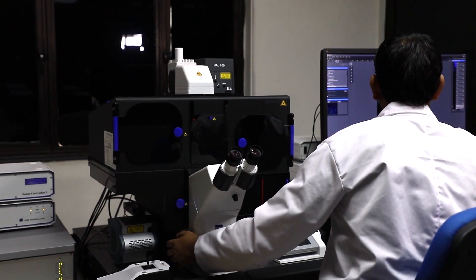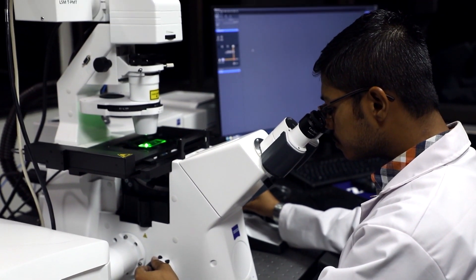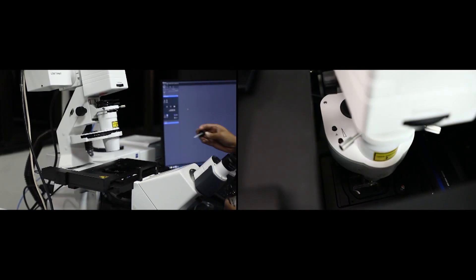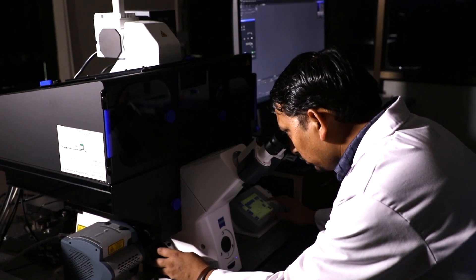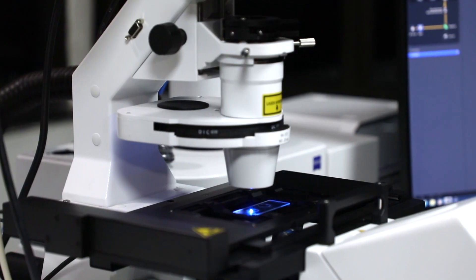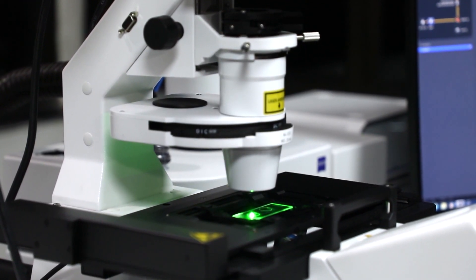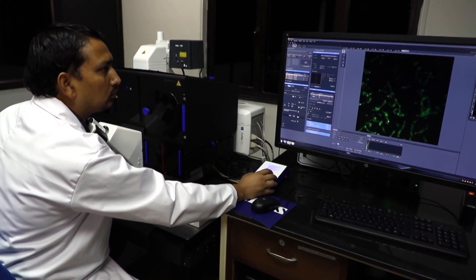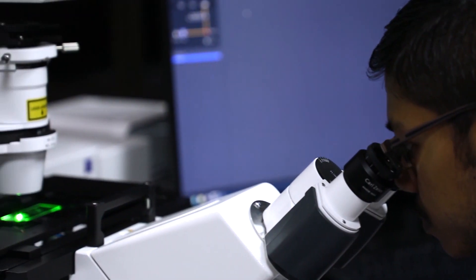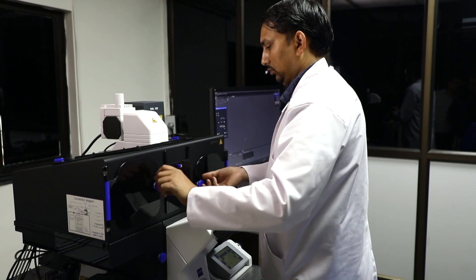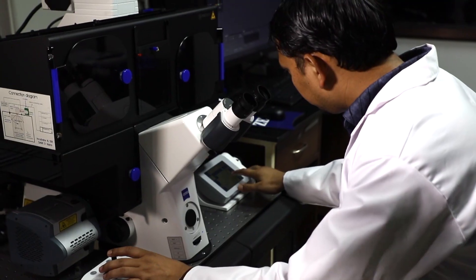Super resolution microscope and laser scanning confocal microscope. Both these instruments image fluorescently labelled live and fixed cells, animal tissues and microbial samples. The system is equipped with high quantum efficiency detectors which are helpful in acquiring images even in very low signal.